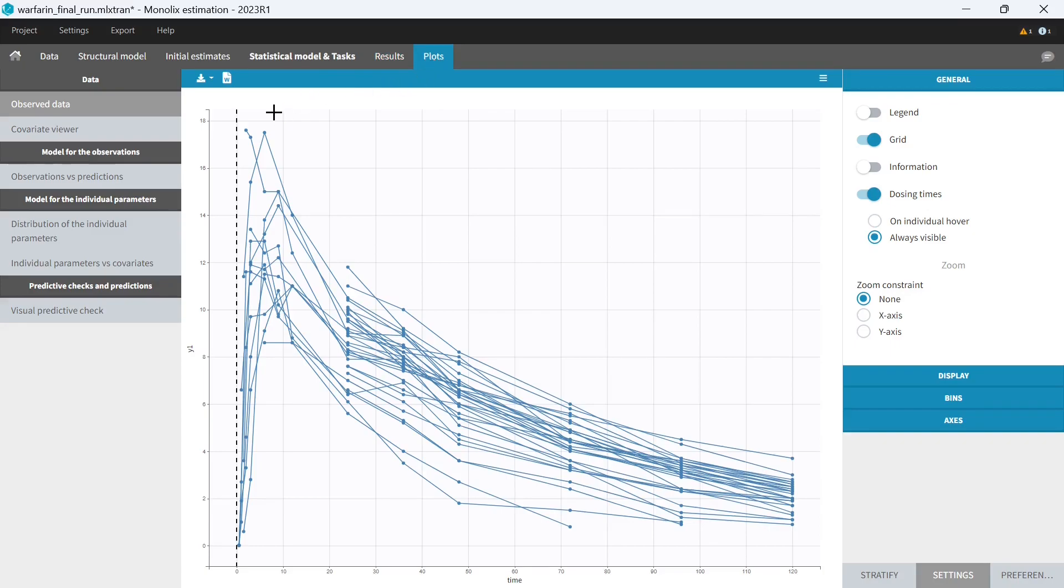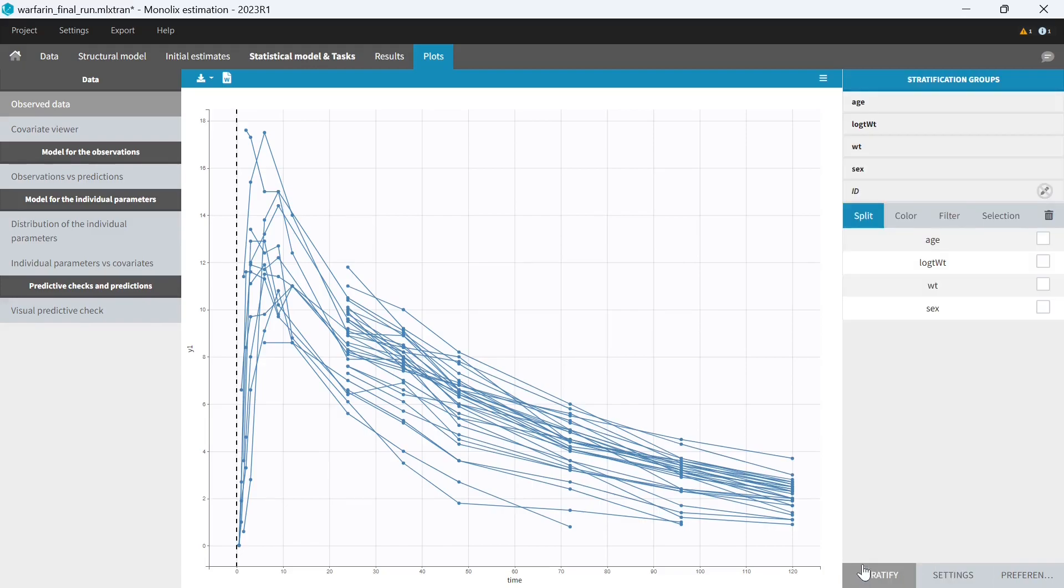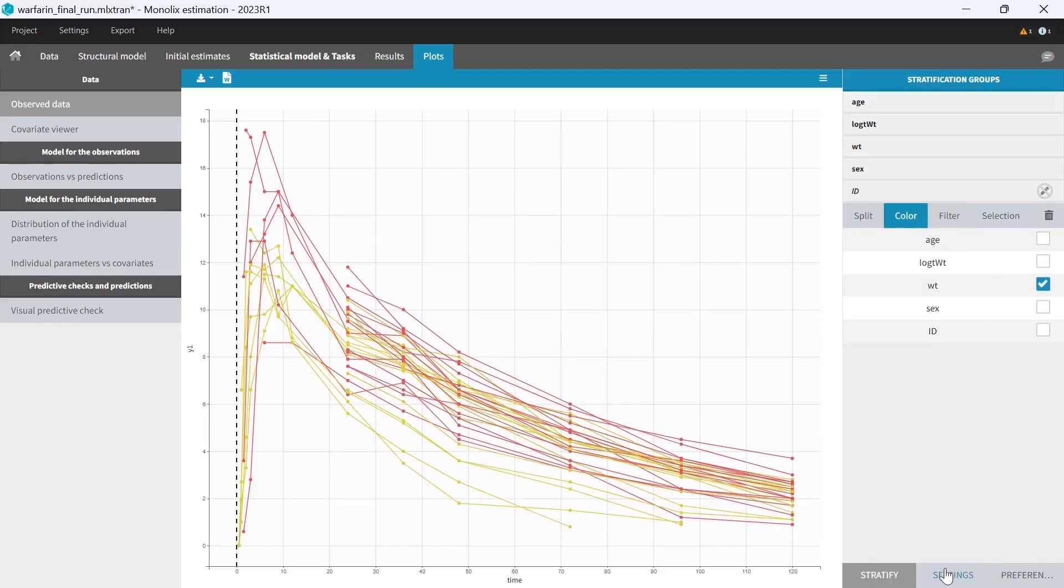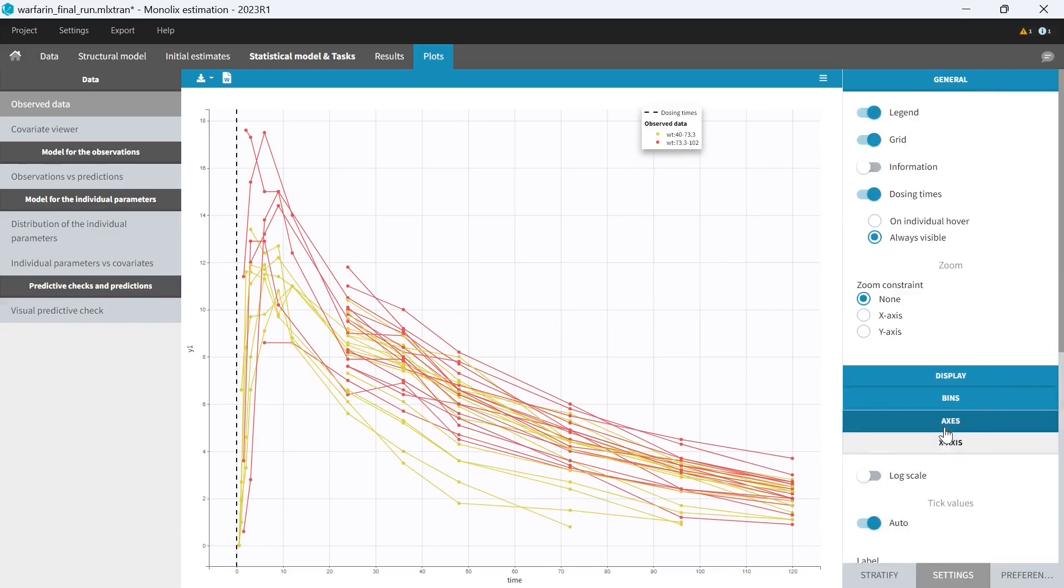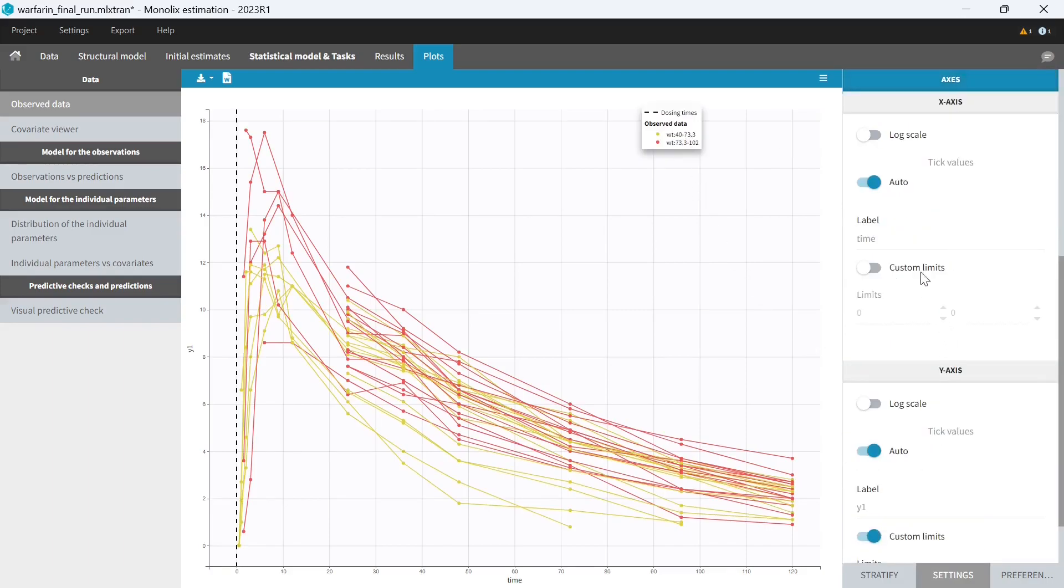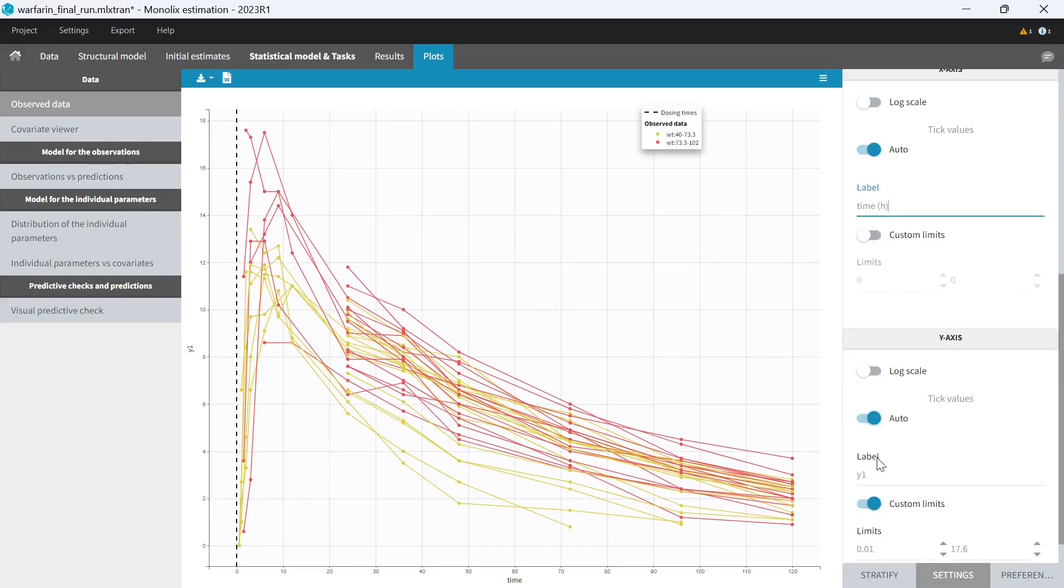Let's look at the plots and customize them a bit to have them exactly as I want in the report. For the observed data, I can, for example, color lines by groups of weight and display the legend. I can also replace the axis labels by time in hours and Warfarin concentration in milligrams per liter. Okay, let's say that's it for observed data.